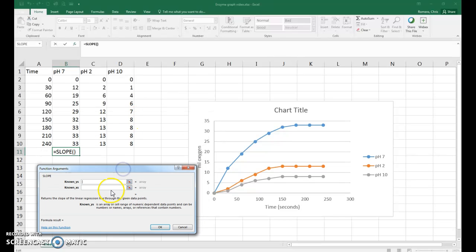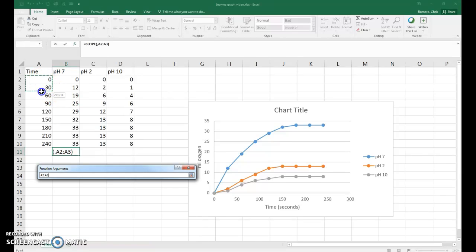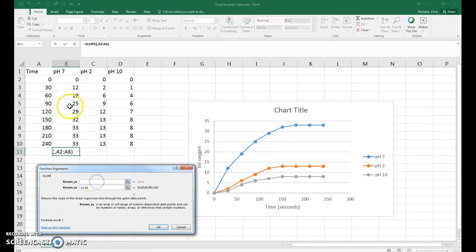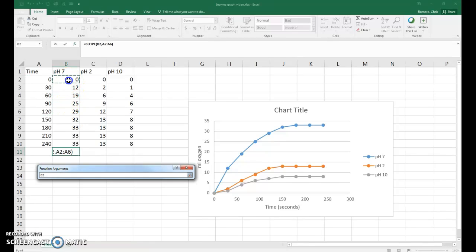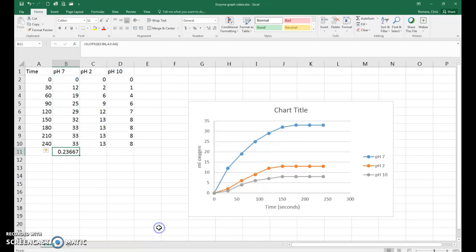Now we've got another window open here and it's going to ask us for our known y's and our known x's. So click on the line that says known x's and then go over and select 0 to 120. Then go down and click in the window where it says known y's and click the corresponding y data from 0 to 29, which corresponds to 120, and then hit OK.